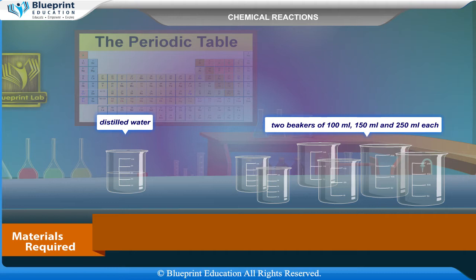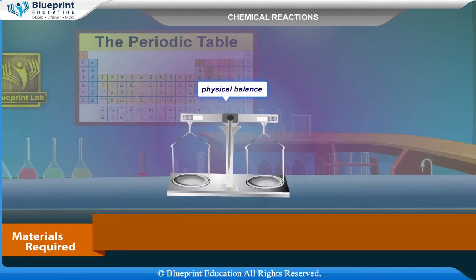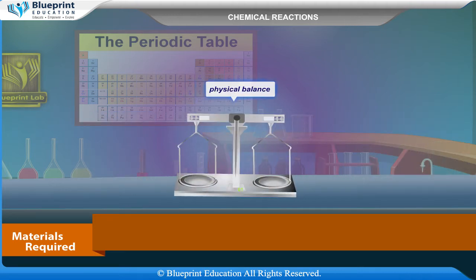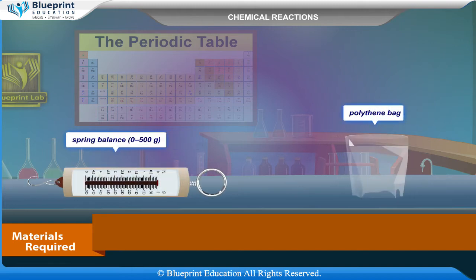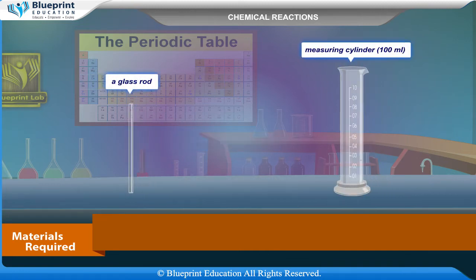Also required: beakers of 150 ml and 250 ml each, a physical balance, a spring balance (0 to 500 gram), a polythene bag, 2 watch glasses, a glass rod, and a measuring cylinder of 100 ml.